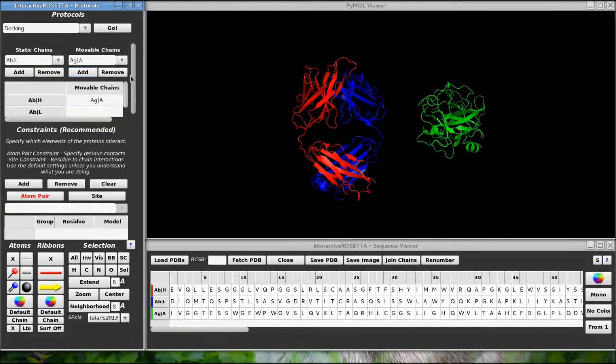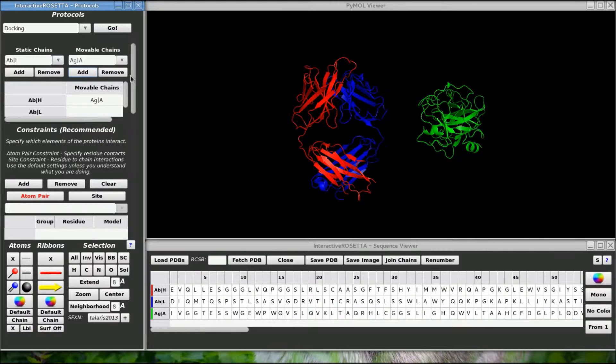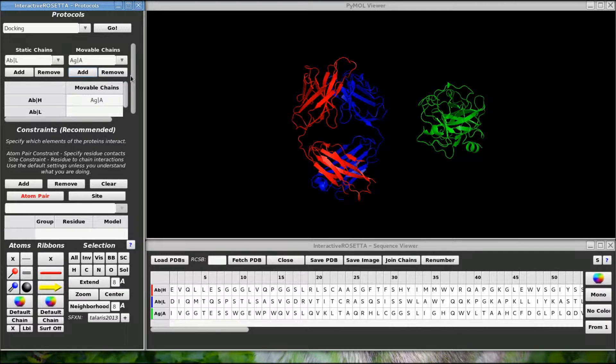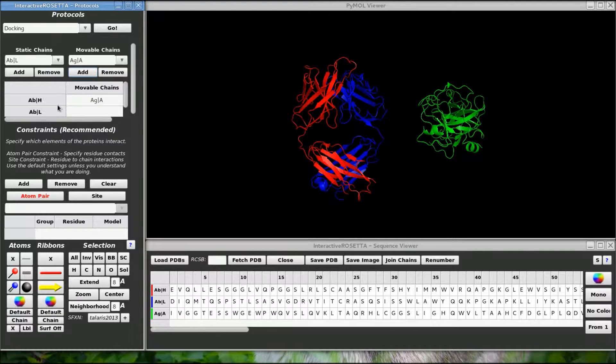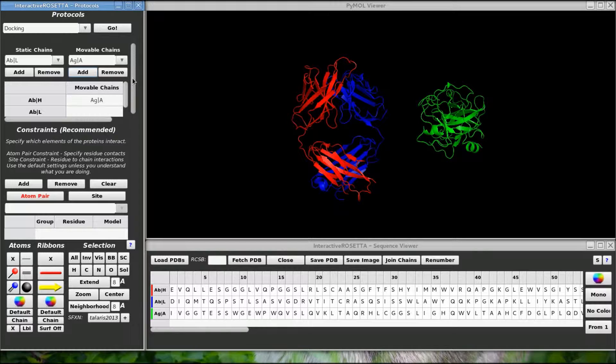I should point out that it is not necessary at this point for the groups to be in the same model. You can take chains from diverse models and put them into this grid right here. Interactive Rosetta will automatically put them into a single PDB structure before performing docking.